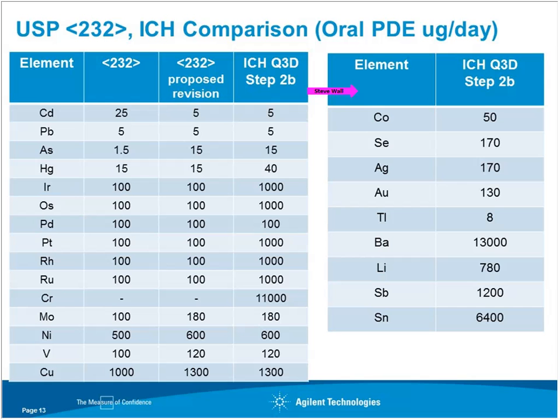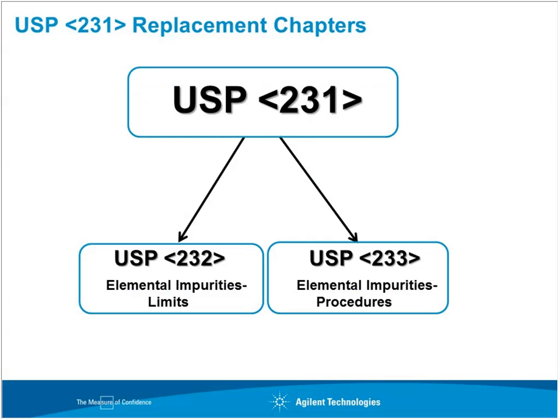So for example, with mercury, they say, hey, we'll just adopt a limit of 15, be sure that we can hit the limit of 15. If it goes up in the future, that's great, but let's be sure we can hit 15. And same thing with the elements. They may also want to be sure that they can cover all these elements. That way they're, again, covered for the worst case scenario, and they can move forward with minimal risk.